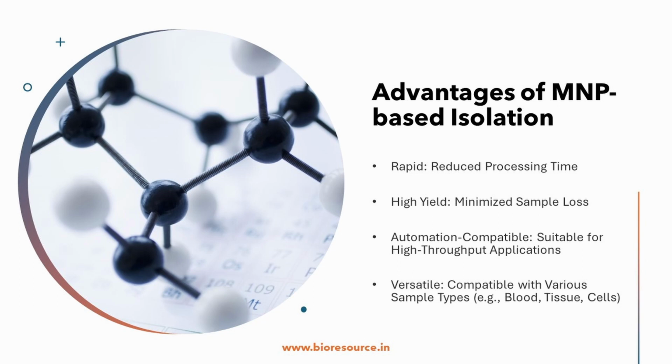Second is high yield. The traditional methods often involve multiple steps with the potential for sample loss during the transfer and manipulation, whereas MNP isolation offers a streamlined process with minimal handling steps. The magnetic separation ensures efficient capture of the target molecules, minimizing the sample loss and maximizing the yield.